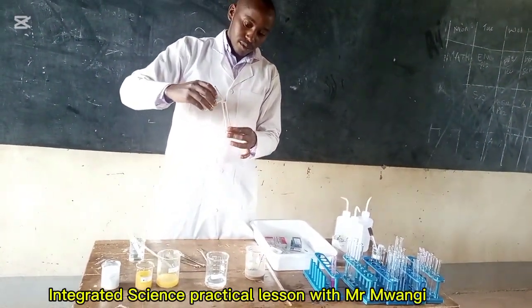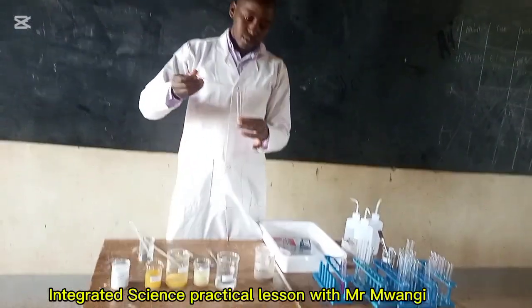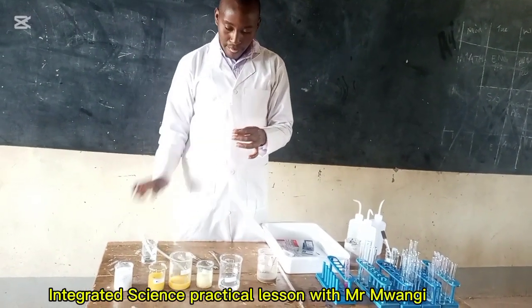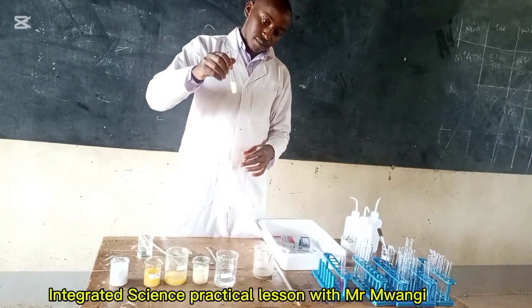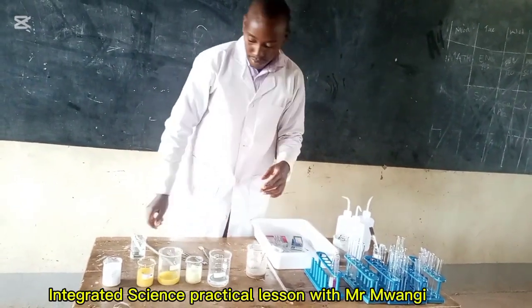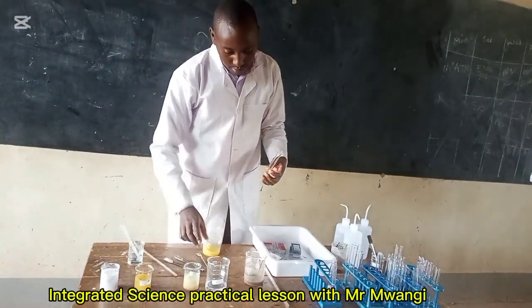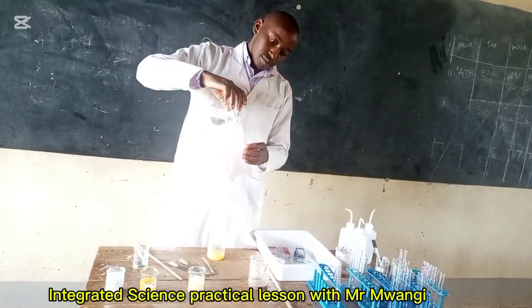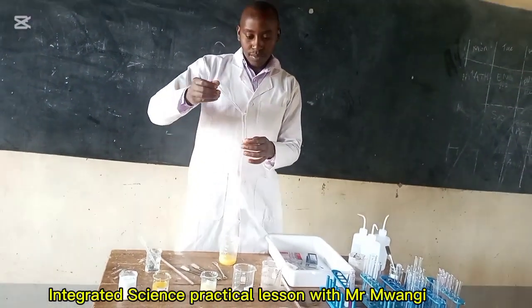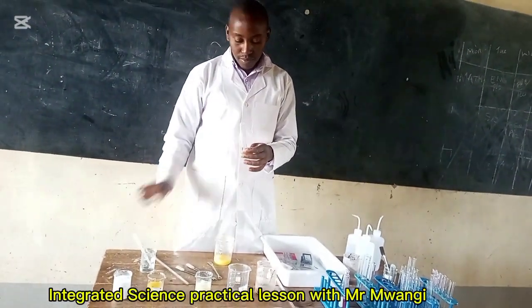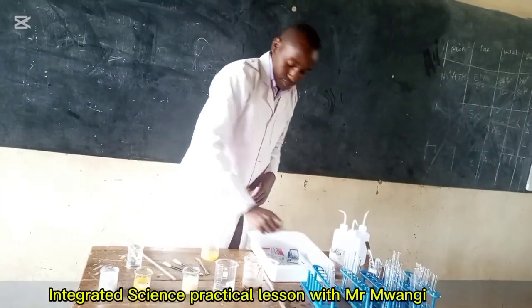I'll pick a second test tube and add a few drops of solution D — in my case that was lemon juice — and I notice that the color will not change; it will remain colorless, meaning that is an acidic solution. I'll pick another test tube, add solution B which is colorless, and add a few drops of phenolphthalein indicator. Again the color will remain colorless, meaning that is a neutral solution.